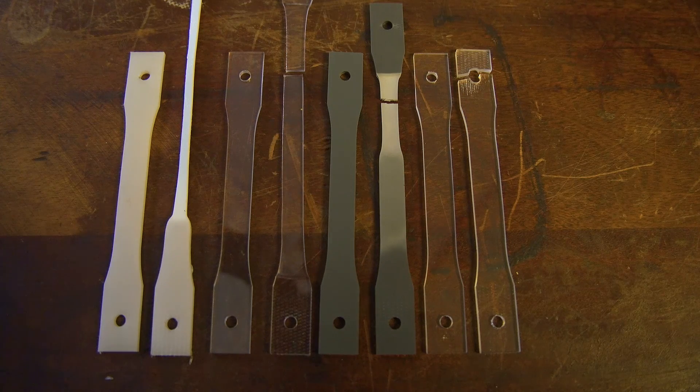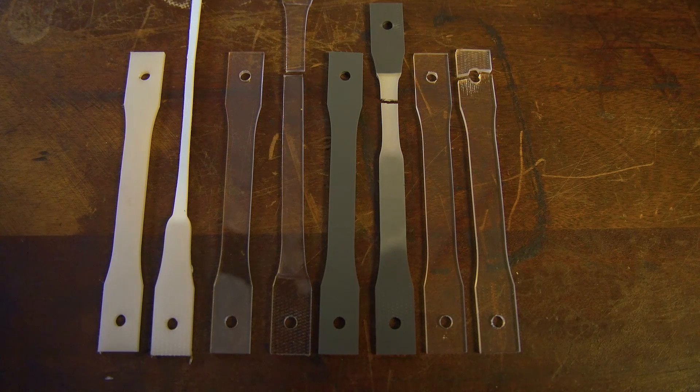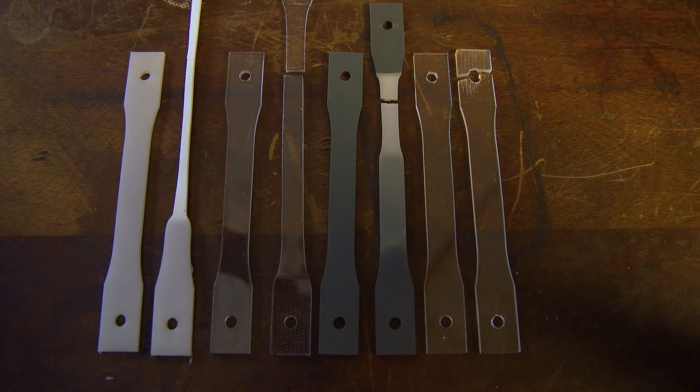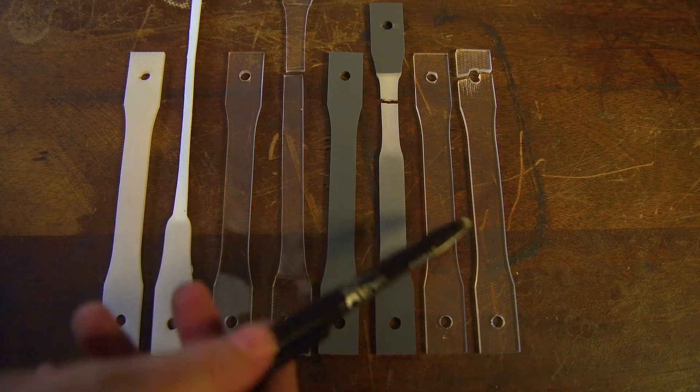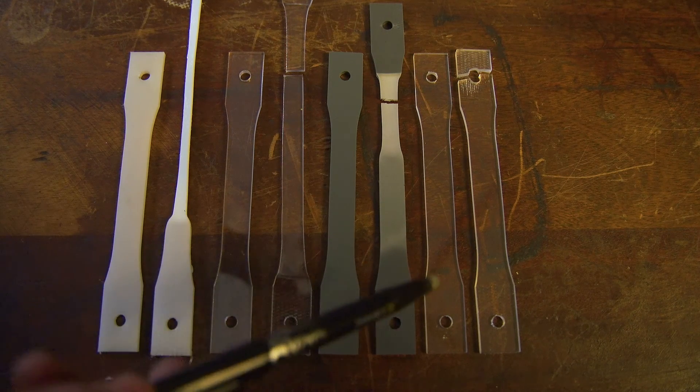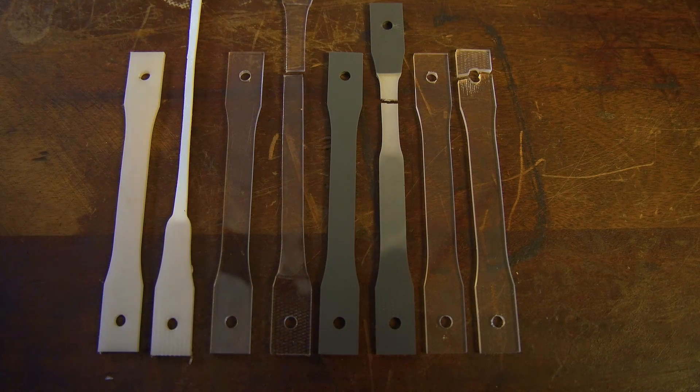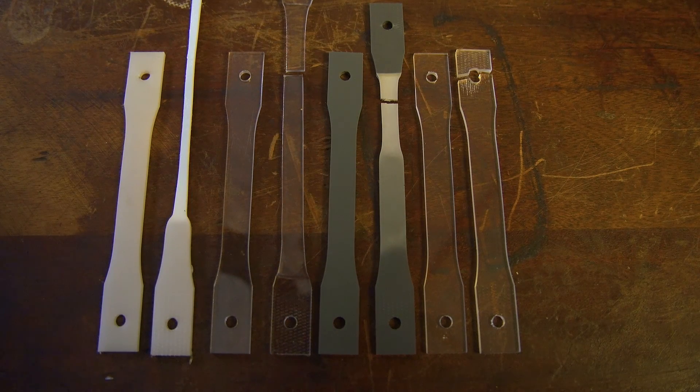So here we have a comparison of two of the samples that we've shown you being tested, and two of the samples that I have tested off the video. On the far right over here, we have the Perspex sample. As you can see, the Perspex sample did not plastically deform much, and it actually failed in the grips. And this is evident of the brittle nature of the Perspex.